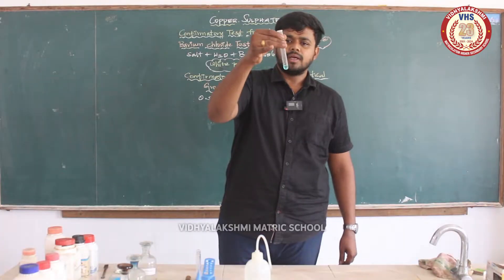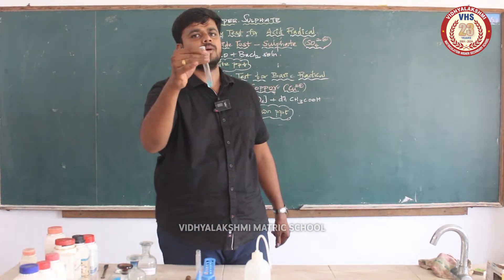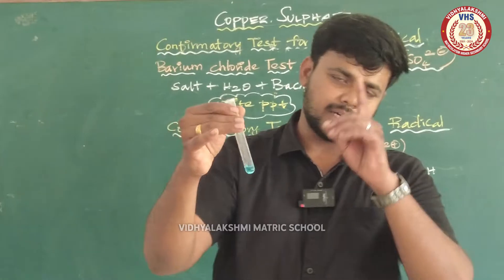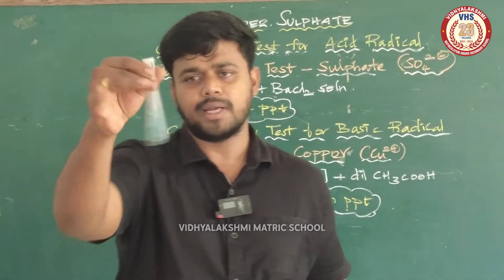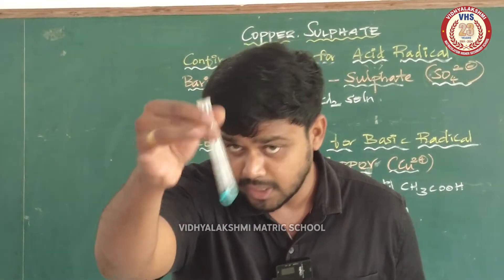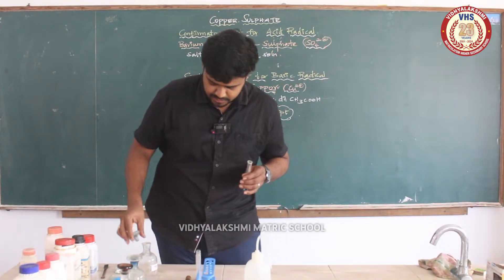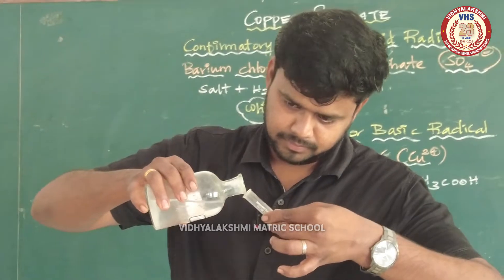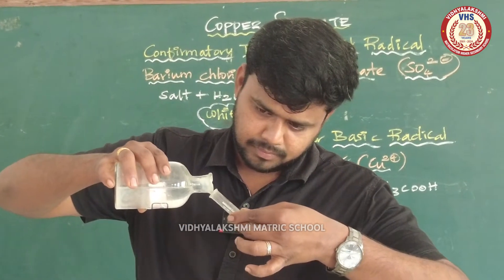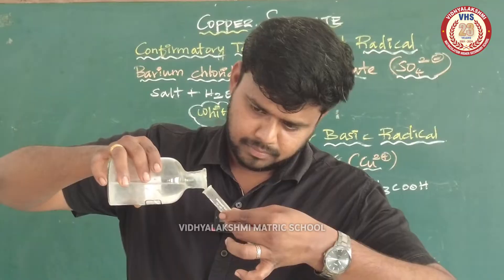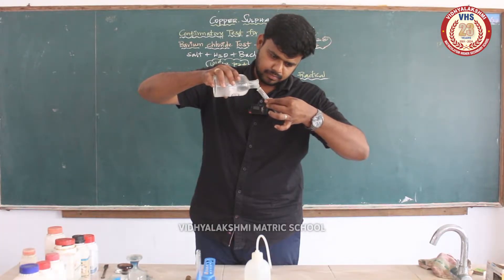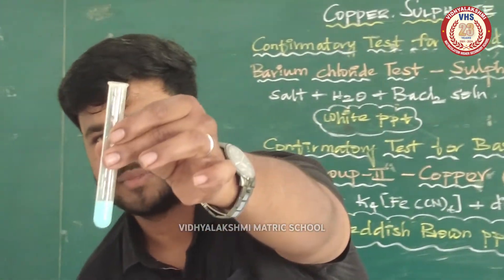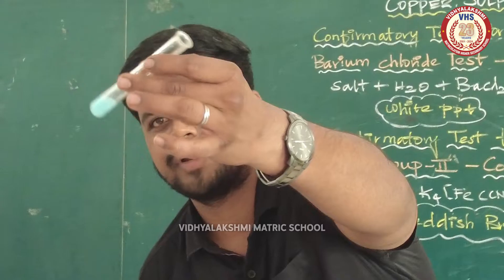It is just the disappearance of this blue color. Blue color disappearance is a confirmation. If you have a colorless salt, you will get 100% white precipitate. Now, the solution is in the blue color. If I add this barium chloride solution, this is your end point in the copper sulfate.